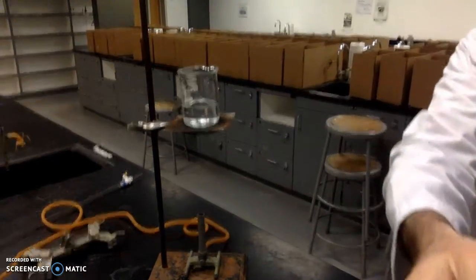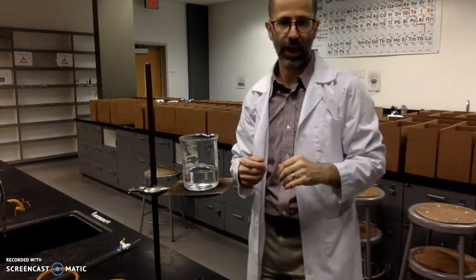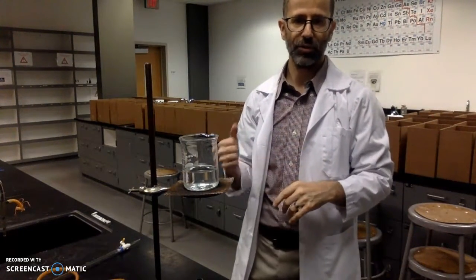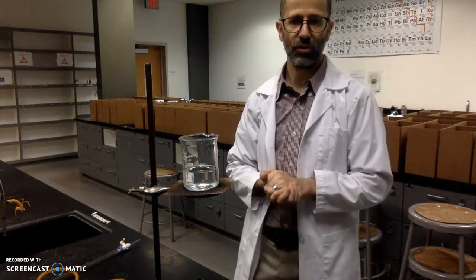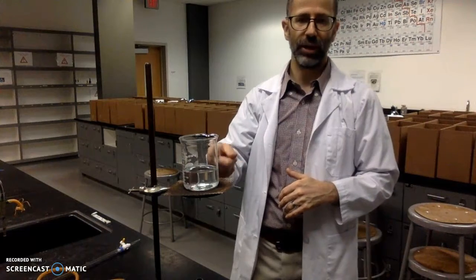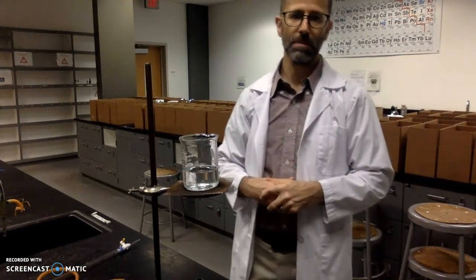If you don't see a reaction after mixing it, and you're observing, is there heat or anything? You don't smell anything, there's no heat change, no color change, whatever. You can always put it in the water bath for a minute. Doesn't take that long.